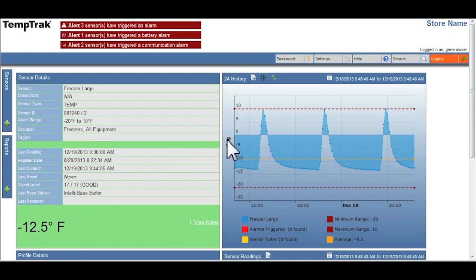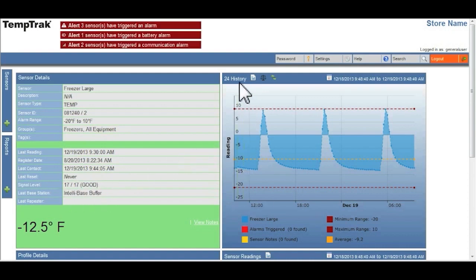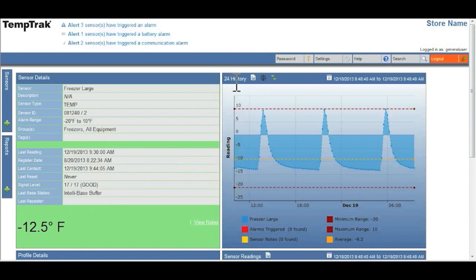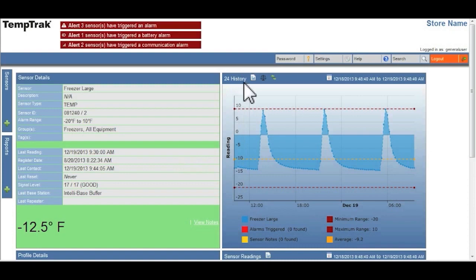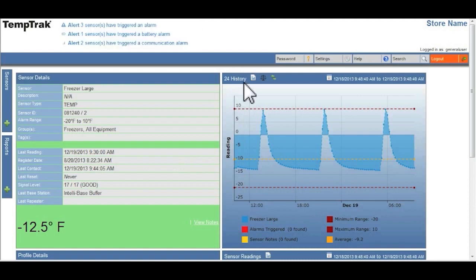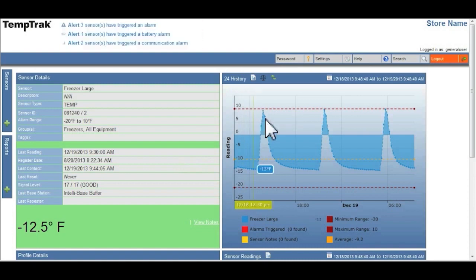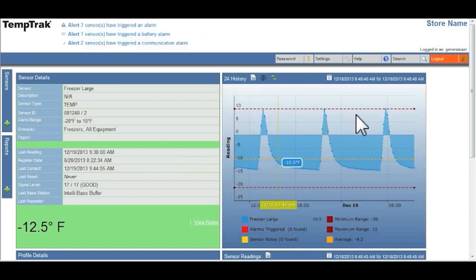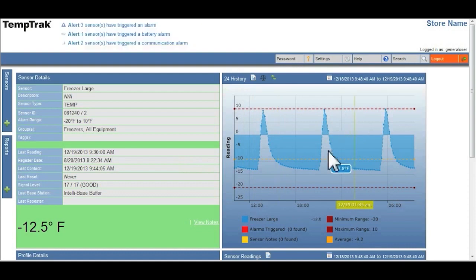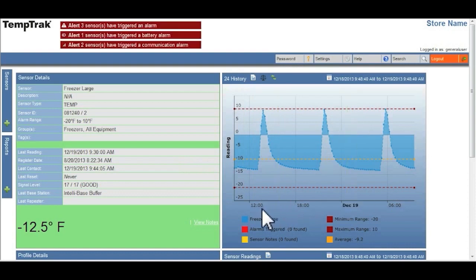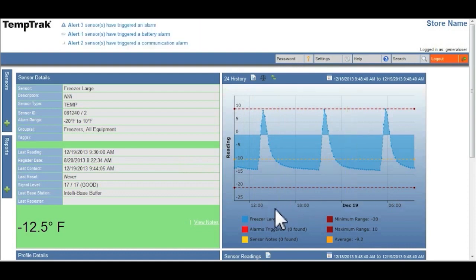The 24 hour history in the upper right hand side provides you with a graphic depiction of every temperature taken on this piece of equipment within the last 24 hours.